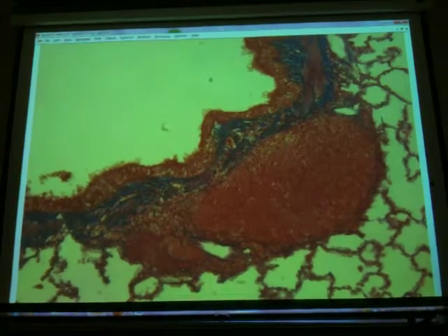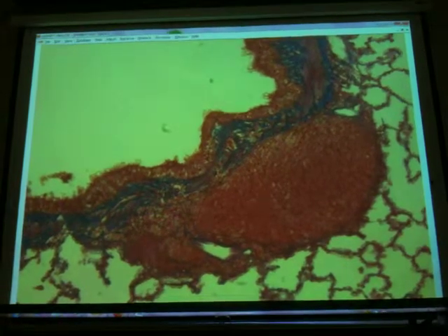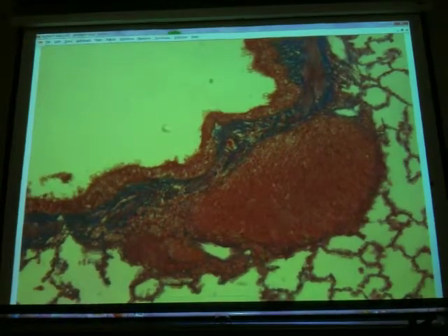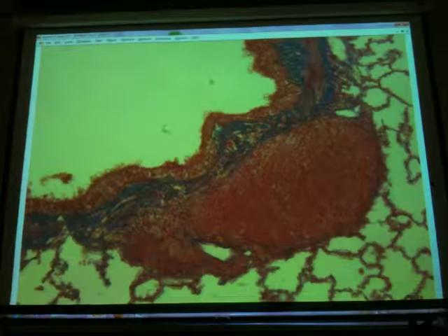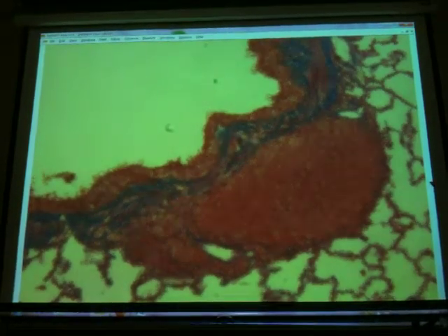So the only way to clean the respiratory exchange membrane is with roving macrophages, alveolar macrophages. They used to be called dust cells. Okay? So that's the end of what you have to find on the lung. And again, bottom line, recognize the alveoli, that's the structural unit of the lung, and recognize that we are in the lung.